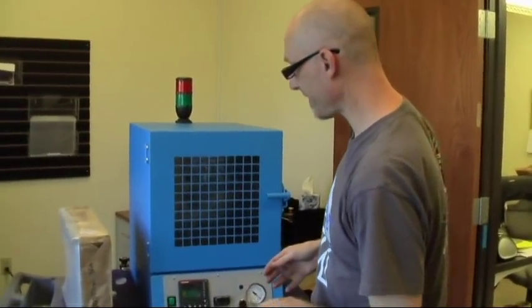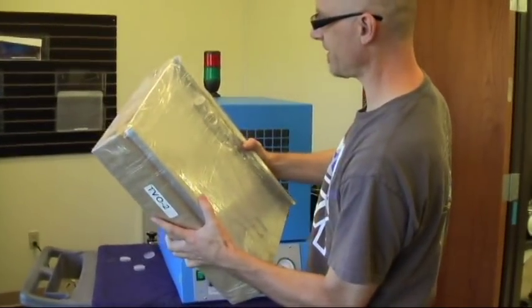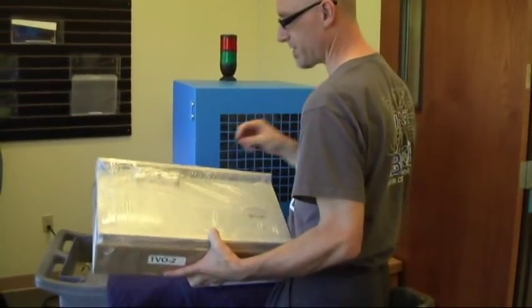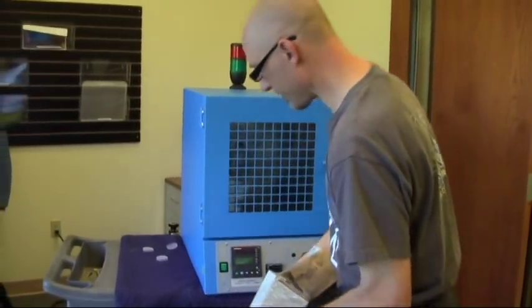When you receive your oven, you're going to get your shelving unit. The shelves are packed up, and it'll have the feet that fit in the bottom of the oven. You can easily just tip it up and screw the feet in and use them to level the oven, and then you can unwrap your shelves.